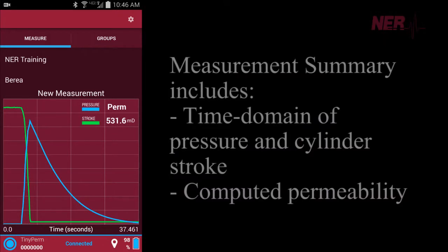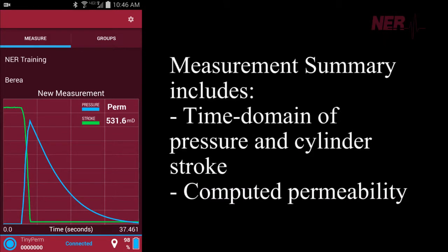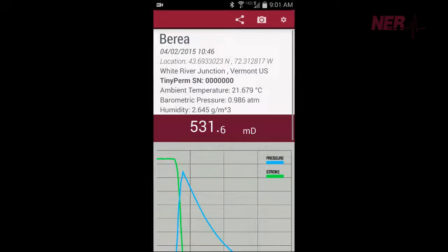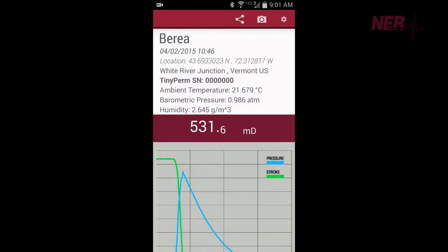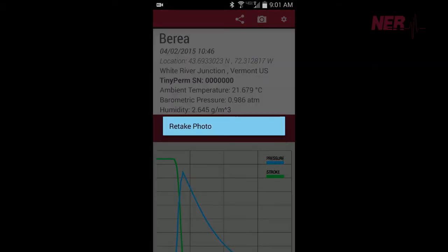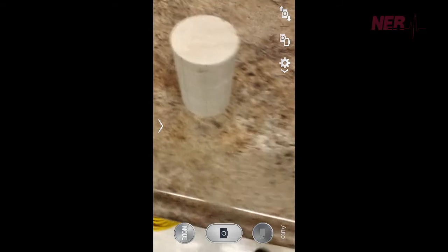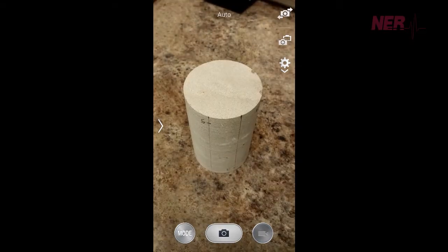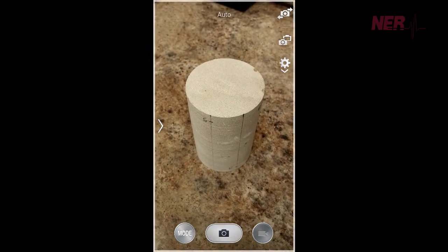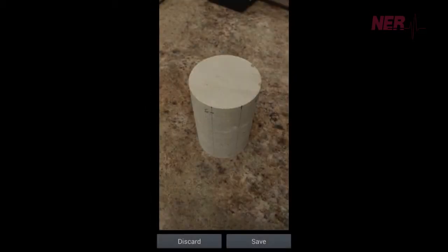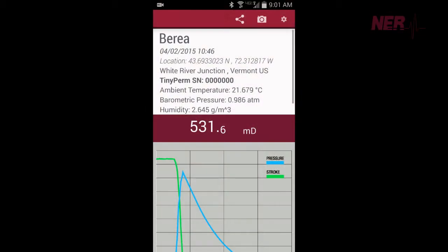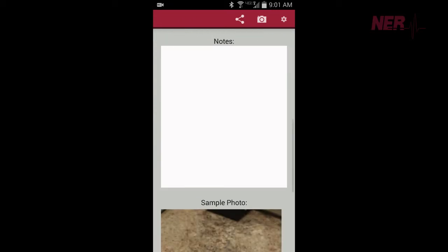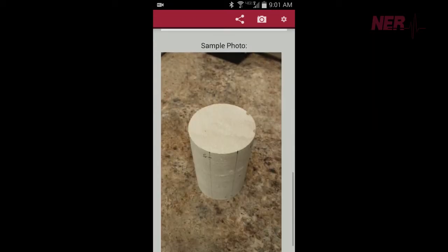Measurements are automatically stored and cataloged on the Android device. Along with the permeability data, a photo of the sample can be stored in association with the measurement. Optionally, you can be prompted to take a photo after each measurement.